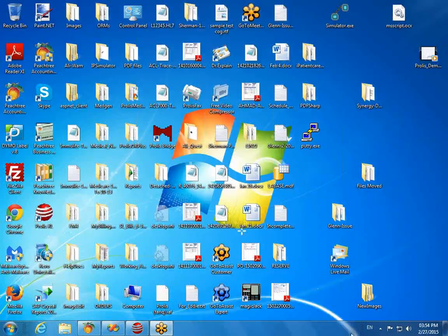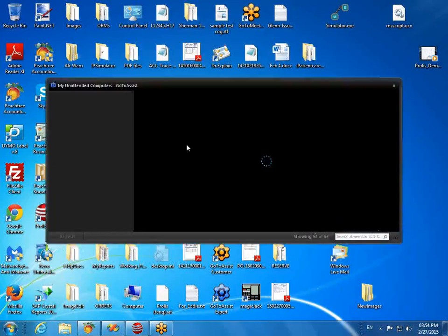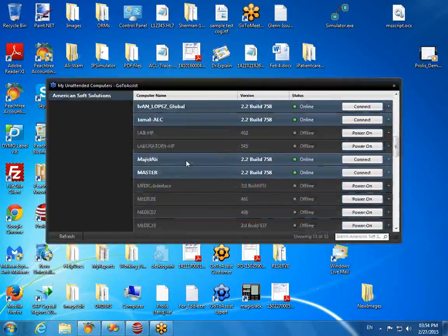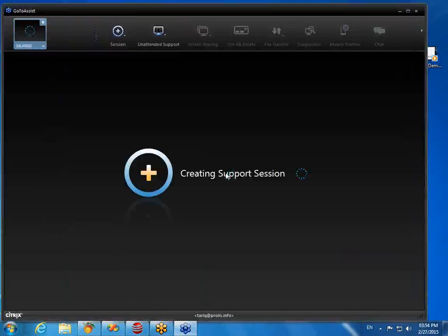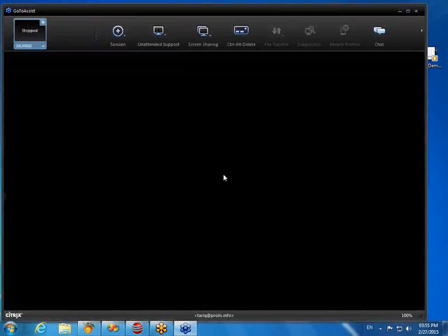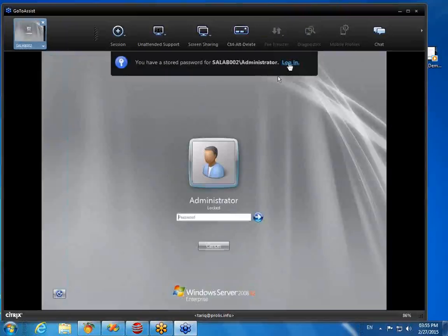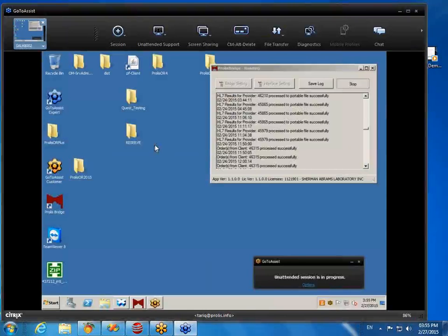I'm going to show it to you. Hold on, give me a second. Show me the Synergy interface. No, I'm not going to show you that. It's a direct conflict, okay? I know, I'm just kidding. Yeah, I know. I'm going to show you a lab which you don't even know. I'm not going to go inside their interface.